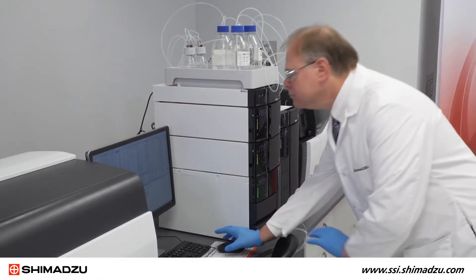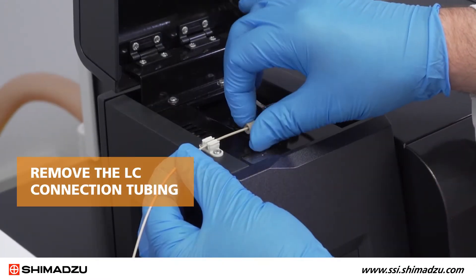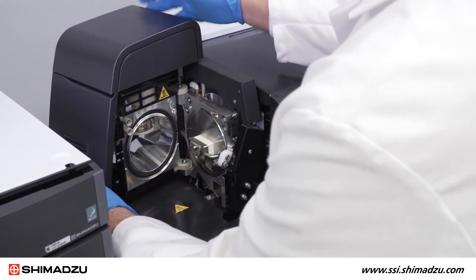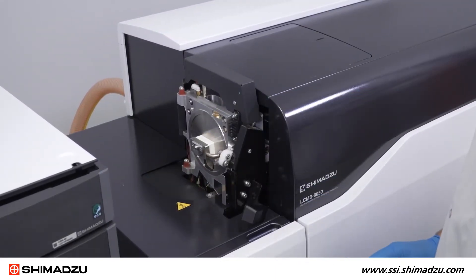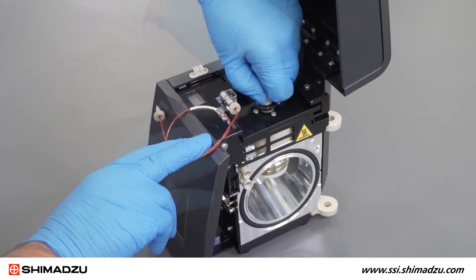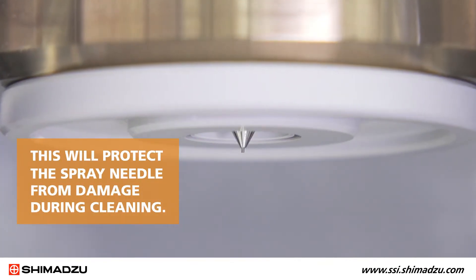After turning off all gas flows and heaters using Lab Solutions software, allow the unit to cool to room temperature. Then remove the LC connection tubing, unlock and remove the ionization unit, and remove the corona needle if present. Before cleaning the spray cone, remove the peak tubing. Then retract the ESI spray needle by loosening the locking collar and rotating the peak nut counterclockwise. This will protect the spray needle from damage during cleaning.